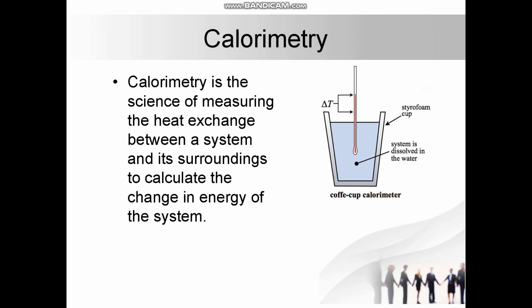This is not a very highly efficient or highly reliable system as there is loss of heat to the surroundings, but this can be considered as a fundamental for other calorimetric instruments that have developed over a period of time. So why is calorimetry important? We must know what and how much heat is being liberated in a process so as to manage that heat by a source of cooling, and what will be the impact of that heat on the materials.